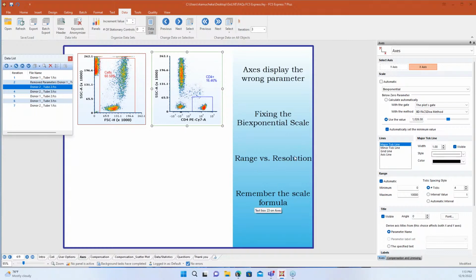So that brings me to the next thing. I've seen a lot of people say, hey, I just want to see this segment of my data. I either want to expand it, or just make it present a little bit differently. A lot of people automatically go to this range section. Now, range can be really great, but if I go to a very small range, I can sometimes introduce these little blank lines in between my data set. It looks kind of like a tiger just went through my population, and I have these little white lines or stripes that go through my data set.